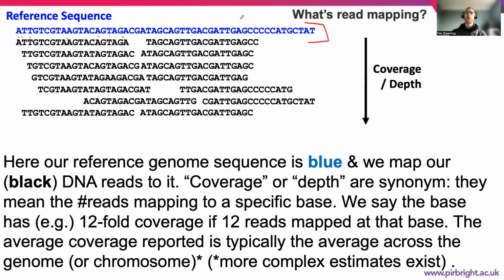And that's the next step when we look in course G04: to identify instances where there might be a base difference between our mapped reads that's consistent across all of them compared to the reference genome. And that would depend on the coverage, in depth, and the read quality.